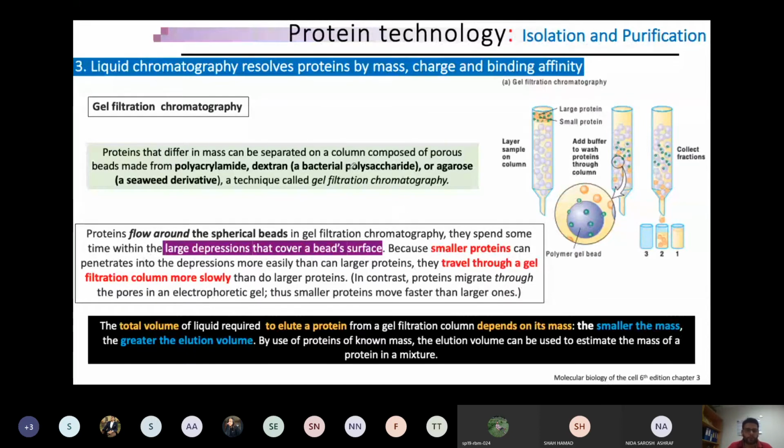So how do you normally do that? You can make a gel filtration column made up of anything. What you have to make is a porous bead matrix. That means any material which has some small pores in it will be sufficient. By the way, our SDS-PAGE is a form of gel filtration. अगर आप लोग थोड़ा सा फोकस करें, क्या हमने किया था वहाँ पर भी, हमने पोर साइज की बुनियाद के ऊपर ही किया था. So this is the porous.